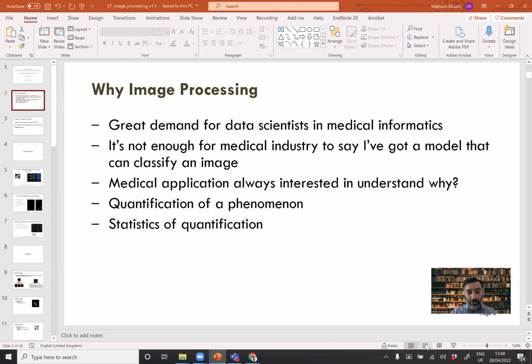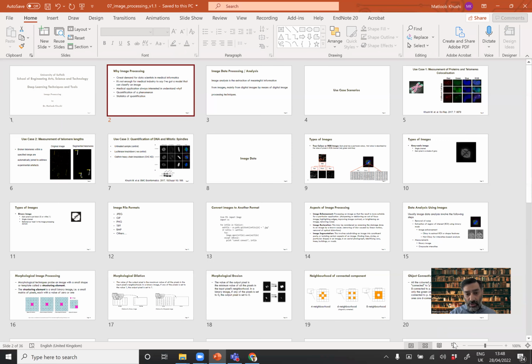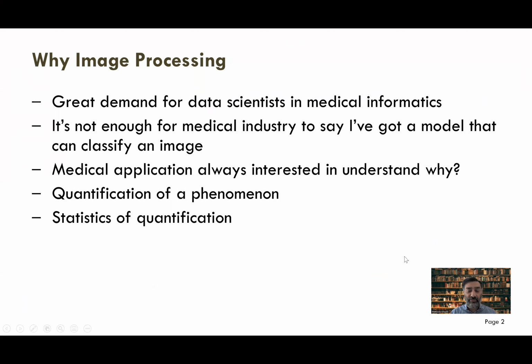But the problem is they don't really tell you why they are doing this classification. And if you are a drug company, in pharmaceuticals, or in research, especially in the medical domain, then you do want to identify why these images are getting classified into so and so classes.